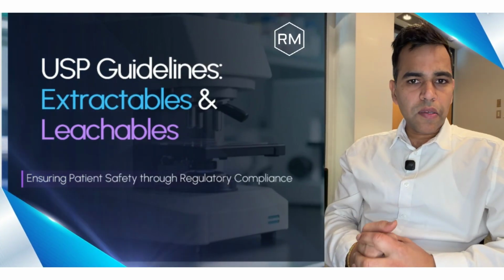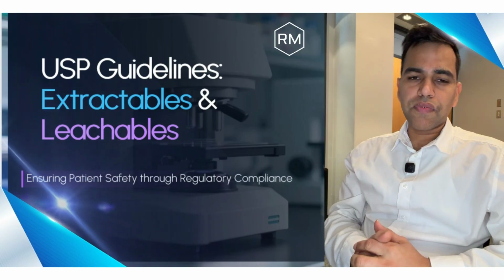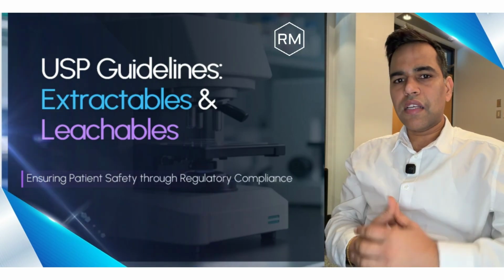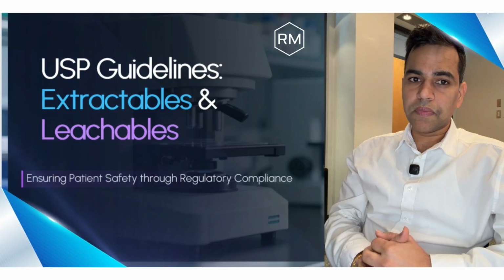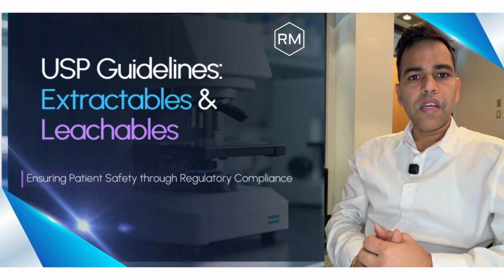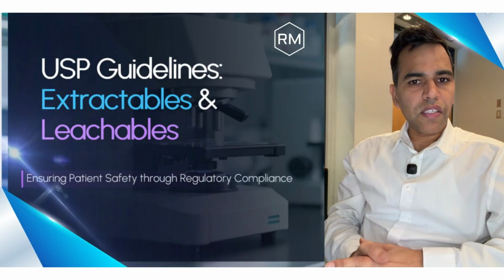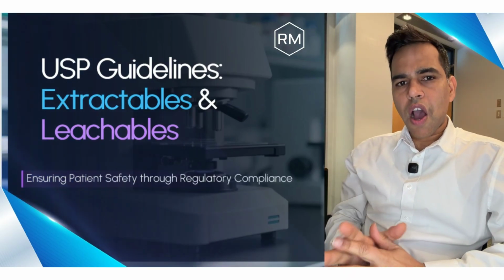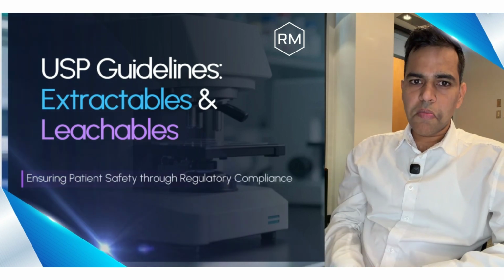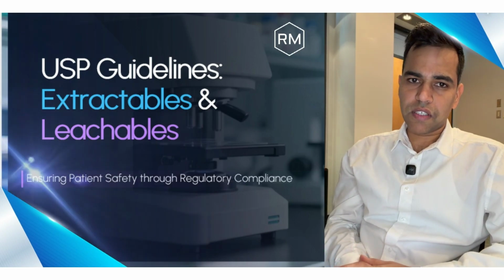Let's start with a simple but critical question. What if your drug product is perfectly developed, but something from the packaging silently contaminates it over time? That's exactly where extractables and leachables, or E&L, studies exist. In this presentation, we'll explore how USP guidelines help ensure patient safety by identifying and controlling these hidden chemical risks.